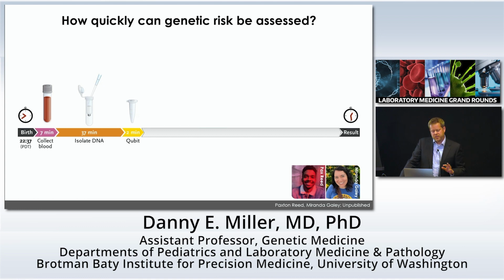So in total, this process takes about 45 minutes or so, but I really think it could be cut down if it's not me doing the DNA isolation.